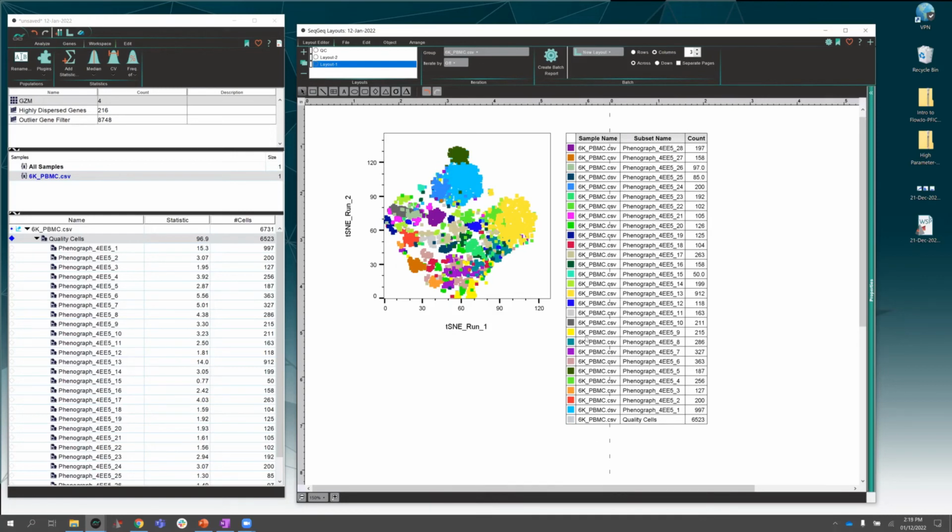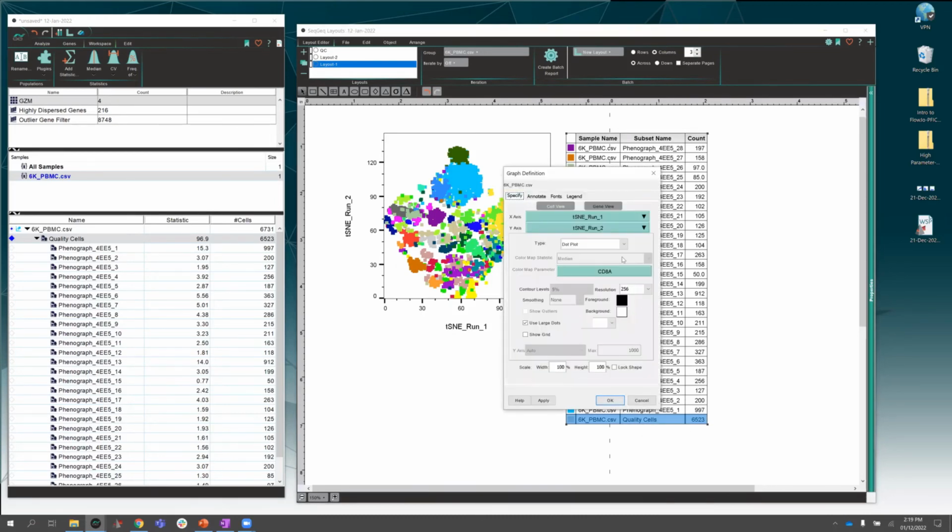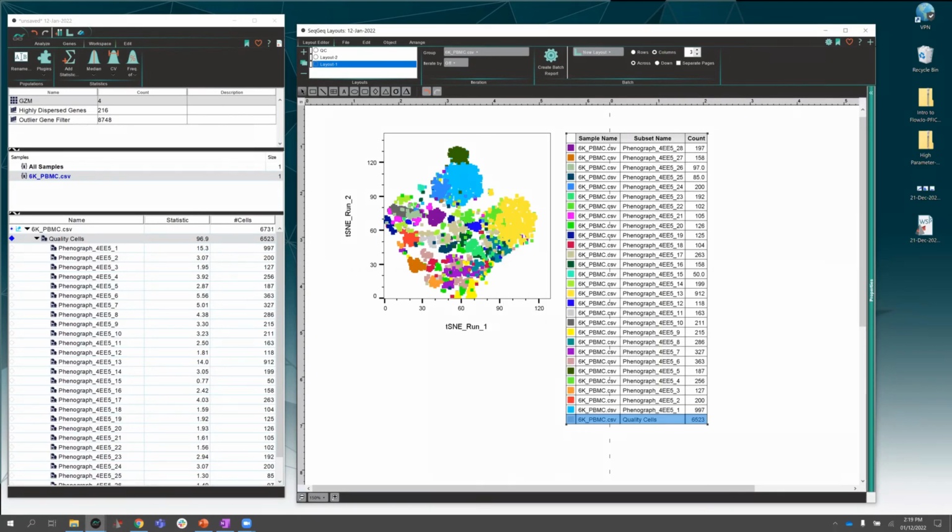So each of these is a dot plot right now, but if I select an entire layer, right, maybe my base layer, hit that, go to properties, specify, right, maybe I want that to be more of a contour plot, right, so it stands out more. You can do something like that and those changes will apply. Okay. And you can also change dot size to help with your resolution, and you can relabel axes if you'd like to, all within that dialog window.